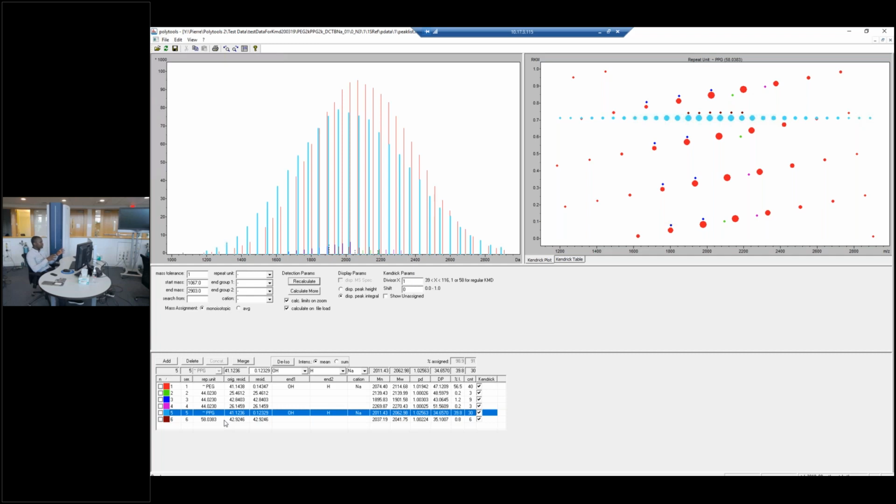For MALDI, it's slightly different. MALDI basically gives you a molecular understanding of each ion that has been produced, and can separate different series, different end groups that attach to different polymer chains, for example, and things like that, and be able to separate them and tell you what they are on a molecular level.